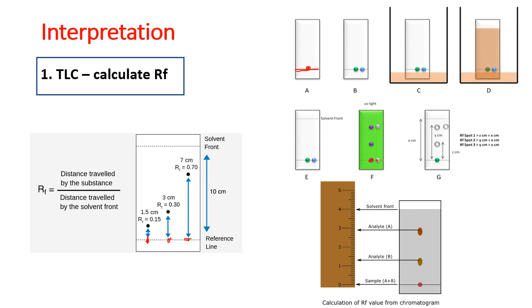So for example, if here I have 2 analytes in this spot, then after passing your mobile phase, you will get 2 separated spots, A and B. Okay, in the lab, you will be given TLC sheets with different spots, and you will be asked to interpret them. First, if a sample gave me 2 spots, that means my sample has 2 different analytes.